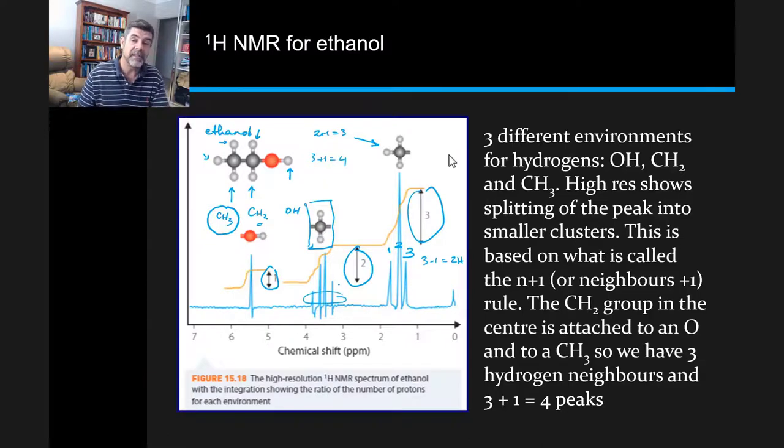We actually have four of these little clusters, which indicate to us that this particular species is located next to a CH3.